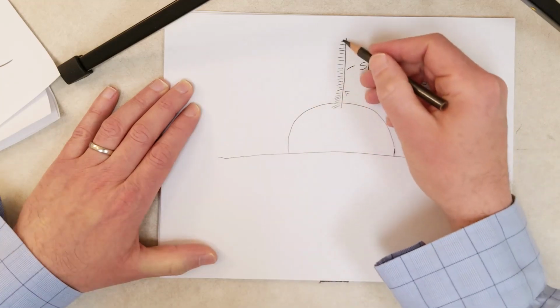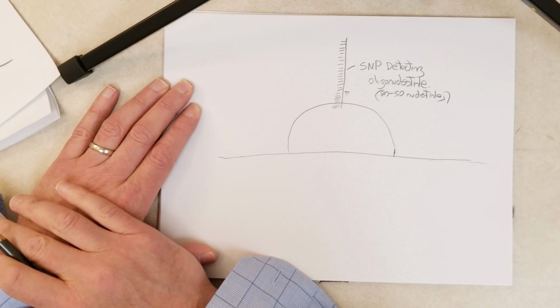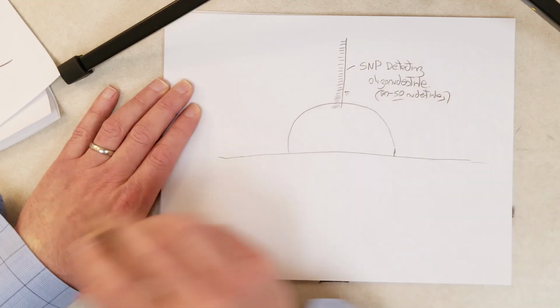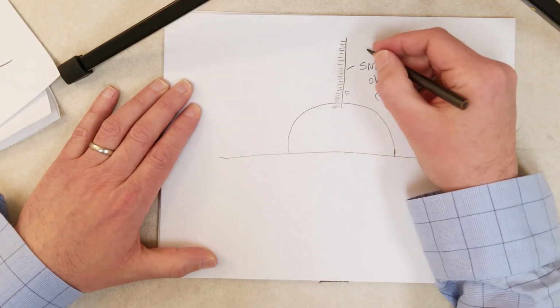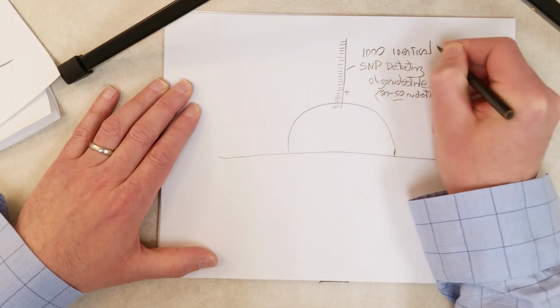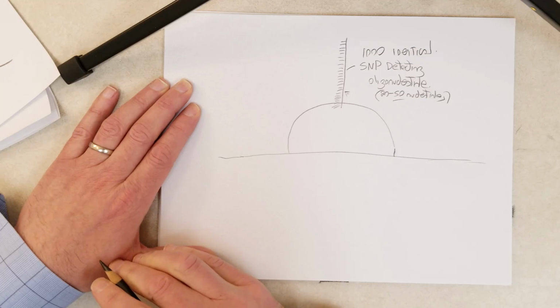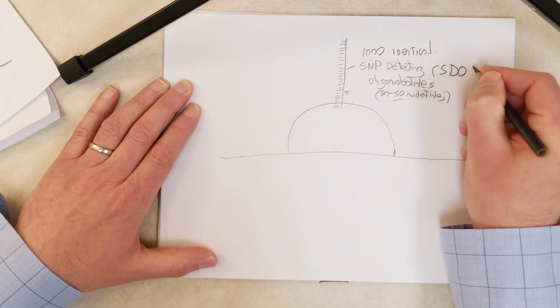And I'm not going to diagram it to scale, though. You'll see in the next diagram, I think I'm going to actually put a sequence on there, so I'm not going to put all 50 nucleotides. Each bead will have 1,000 identical SNP detecting oligonucleotides. Oh yeah, I want to call these SDOs.